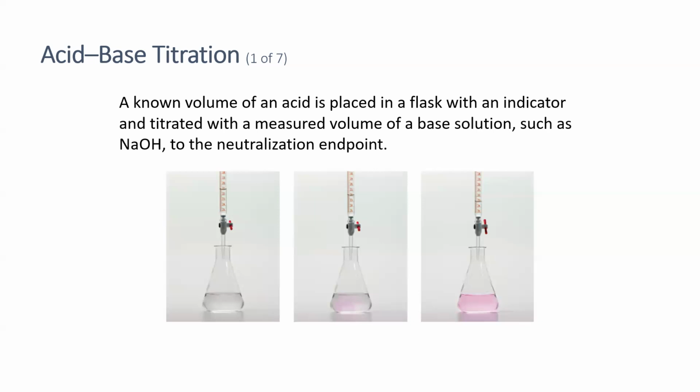However, we don't actually measure the equivalence point, we measure the end point. And the end point is when we see a persistent pink color to the solution in the Erlenmeyer flask, or in your case, it's going to be in a test tube.